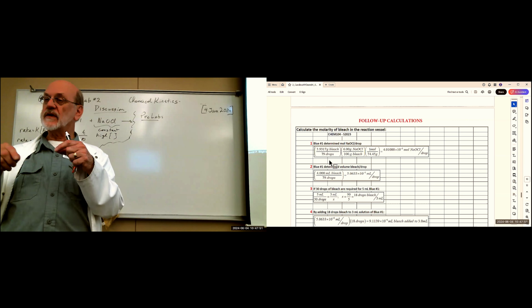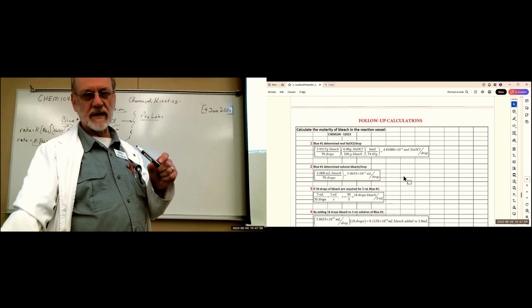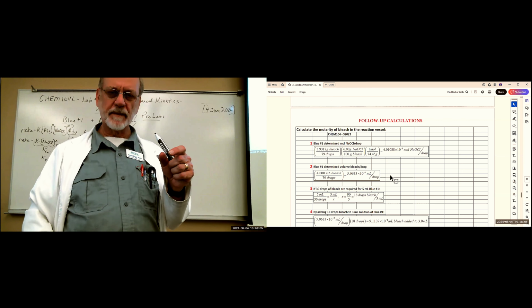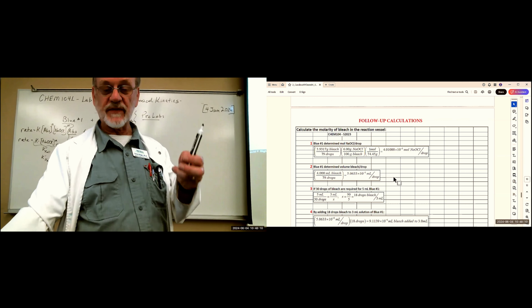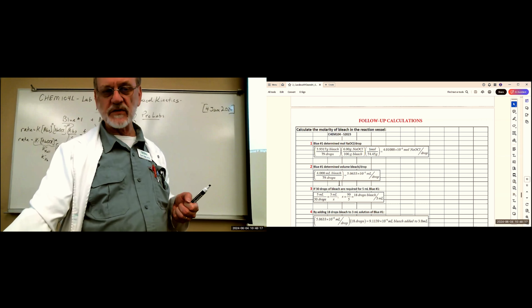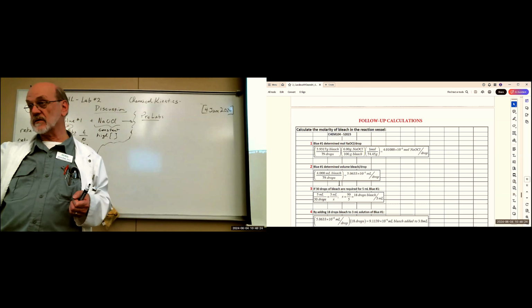Then you need to know what's the volume. Well, you added volume, so it's 3 mils plus something. So that's what we do with the volume of bleach added. Here, actually, there are 2 ways to get that volume per drop. You can either say 4 mils of bleach gives you 79 drops. You take 79 drops into a graduated cylinder and see how many milliliters it is.